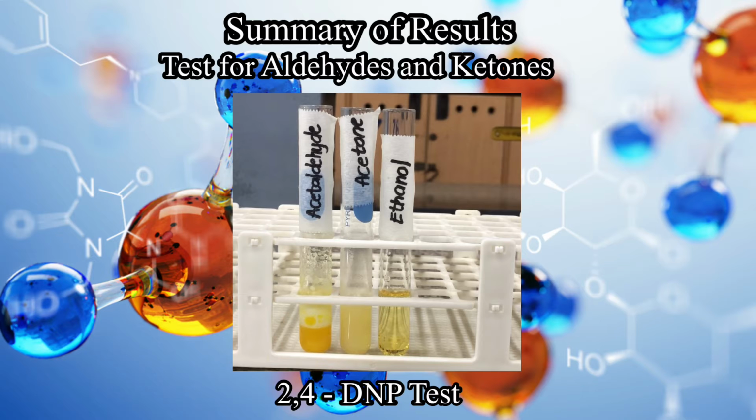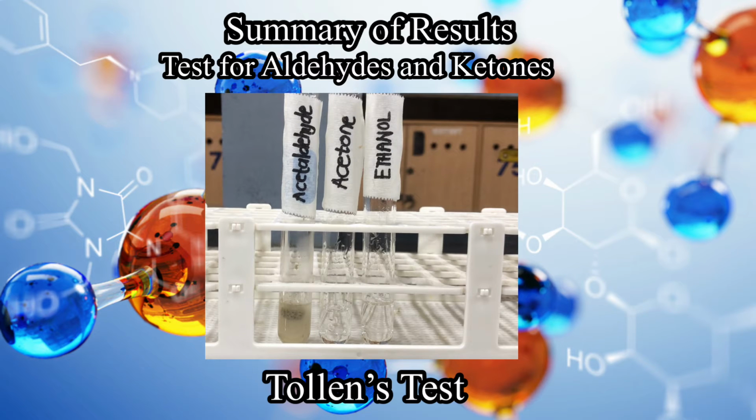As a summary, here's the result for the 2,4-DNP test. And here's for the Tollens test.